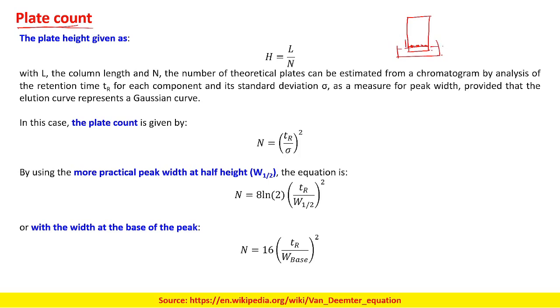The solvent, due to capillary action, moves up, and the solvent front reaches up to this point, and then we take out the plate. The distance between this solvent front and where you applied the chromogens is regarded as L.